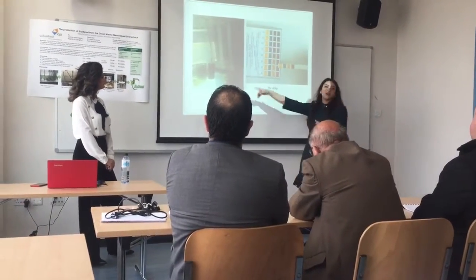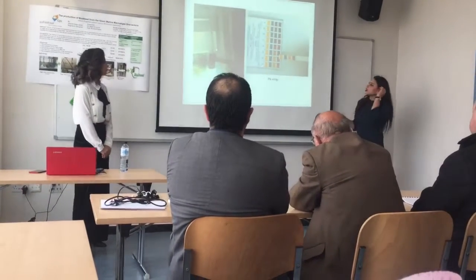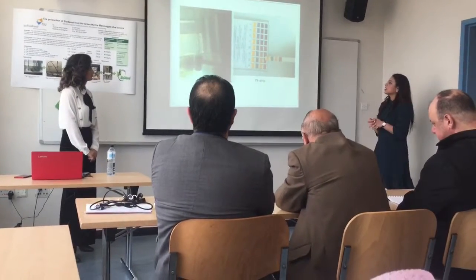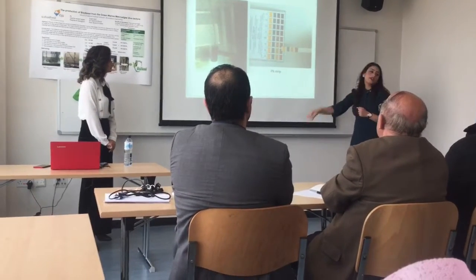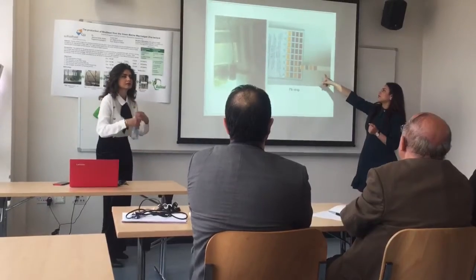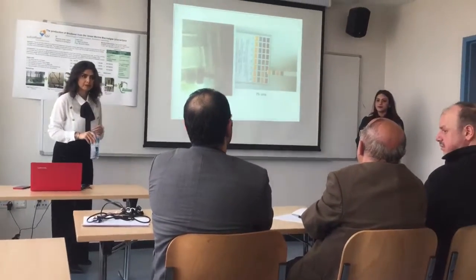Here you can see, as I said, we need oxygen supply. We have an air pump inside the cultivation vessel so that it can cause continuous aeration and oxygen supply to the organisms. And to test our pH, we use the pH strip. We place it inside the water, and then you compare the result with known values, and our value is between 8 and 9 pH. Jeanine, was it CO2 or O2?